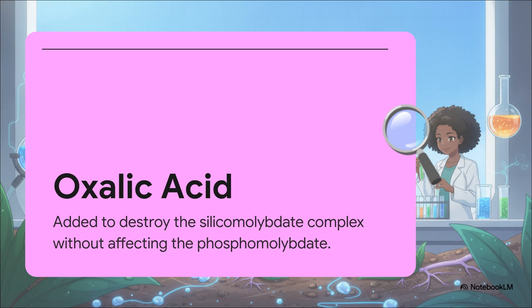Enter the hero of our assay, oxalic acid. When troubleshooting these unexpectedly high or variable results, chemists will smartly adapt the protocol by adding a 0.25% oxalic acid solution to the mix. What it does is amazing.